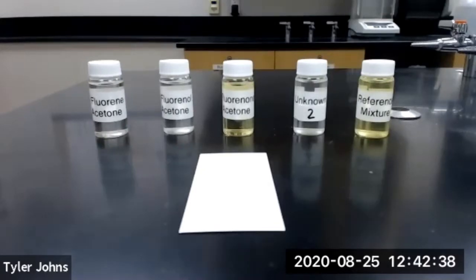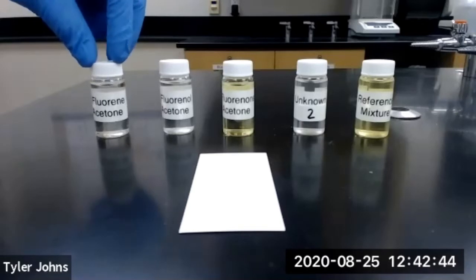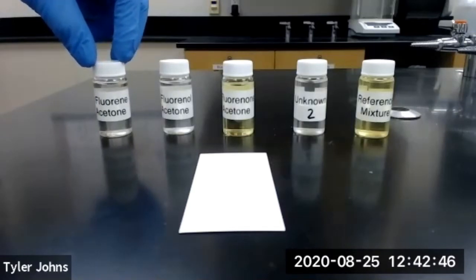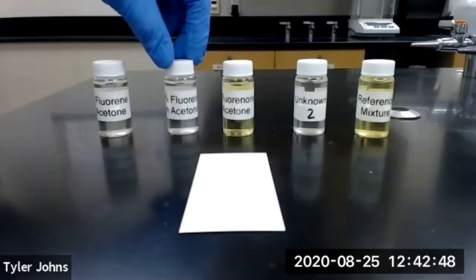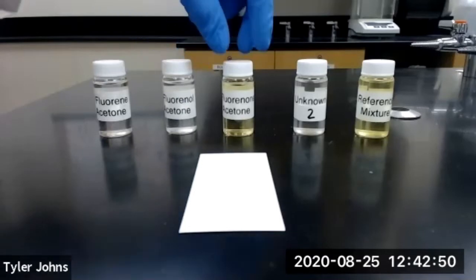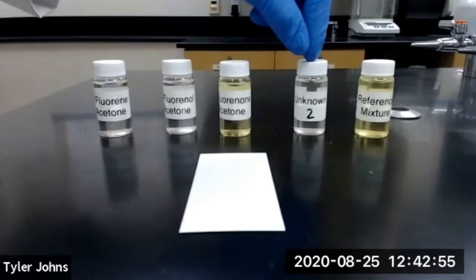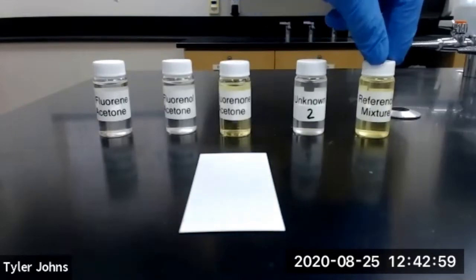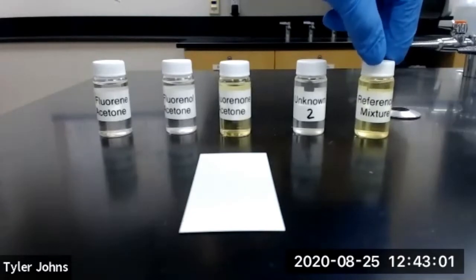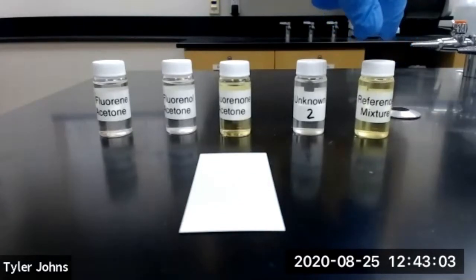We are going to start by spotting 2% solutions of each of our compounds on our TLC plate. So we have our 2% fluorene solution, our 2% fluorenol solution, our 2% fluorenone solution, our unknown number two, in which we need to identify which compounds are in it, and our reference mixture, which contains fluorene, fluorenol, and fluorenone.